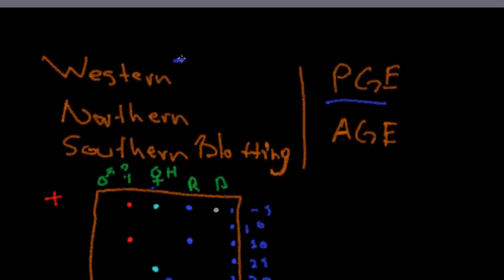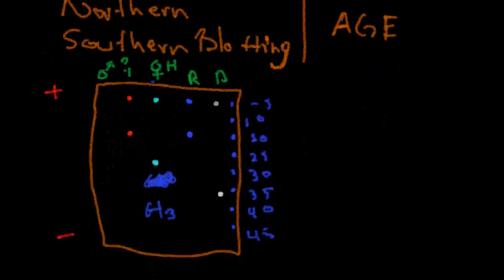Blotting it out with the film gives you an amplification, so you get something that's not this giant bright red dot like you see here, but more in another column over here, a dot like that where, oh God, is that a dot? Am I hallucinating? Is that a fleck on my screen?